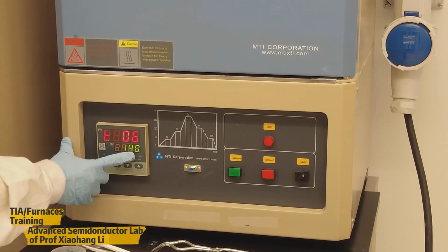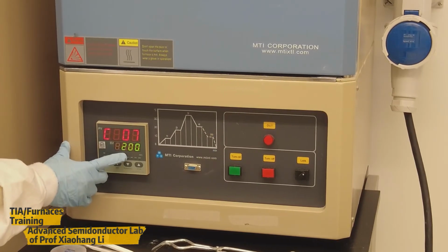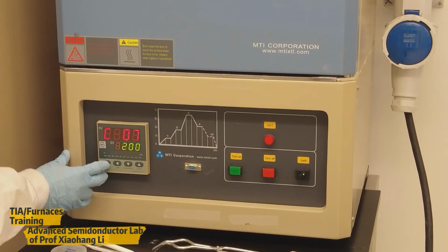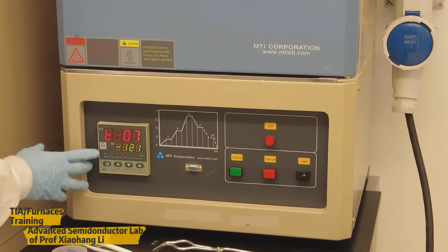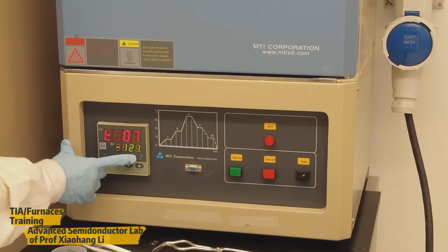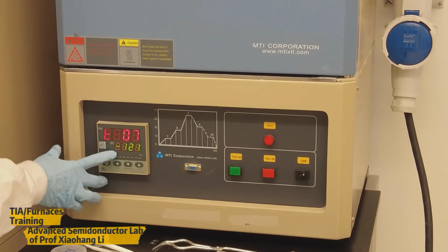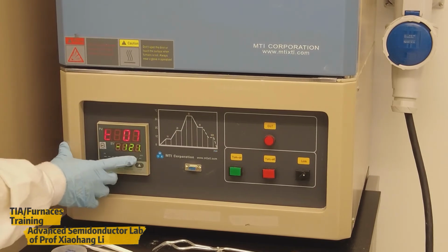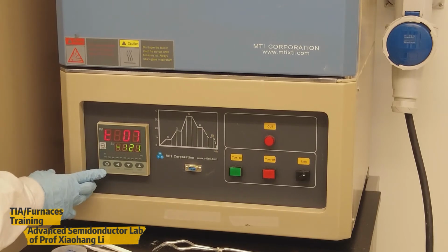With 140 minutes, we'll go down to 200 degrees C. After that, we will end this program. So the set point -121 is the end code of the program. Once you set -121, then the program will be finished.